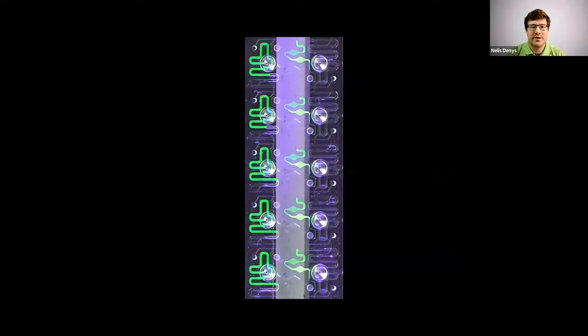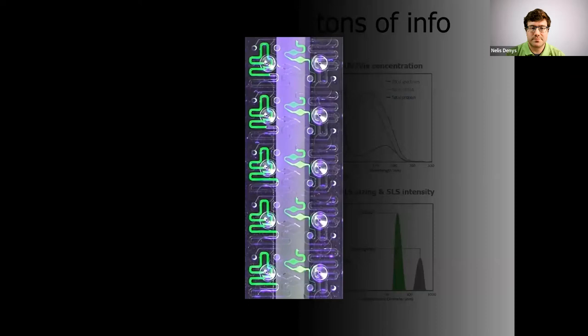So on the left, you can see those loaded samples. And on the right, you can see the samples after being measured with Stunner. The two diamond shapes are the cuvettes for one sample. What this also shows is, after pumping, all the sample remains in the consumable, so there's no contact between the sample and the actual instrument or the pumping system. And so there's no cross-contamination or any contamination possible.